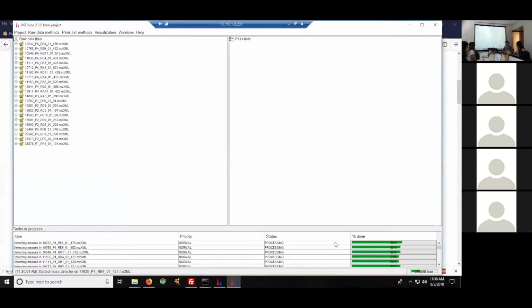Which hopefully will be done soon. How are you guys doing? Everybody got some peaks picked already? Here it's working, that's great. You guys are good? Awesome.